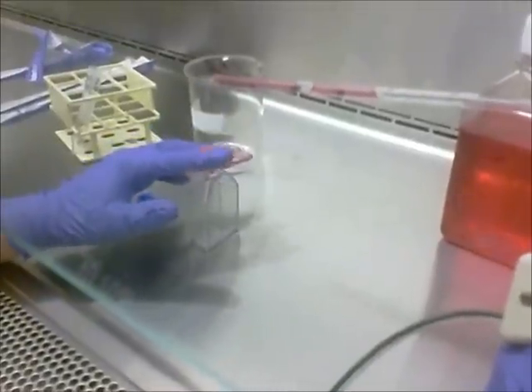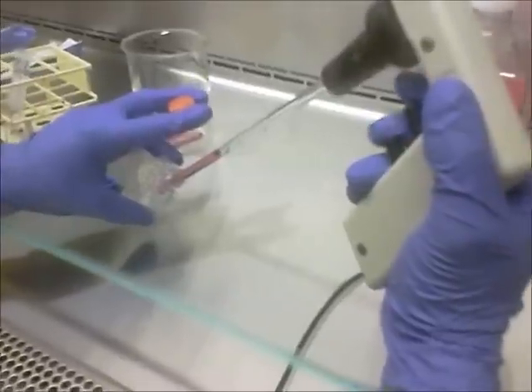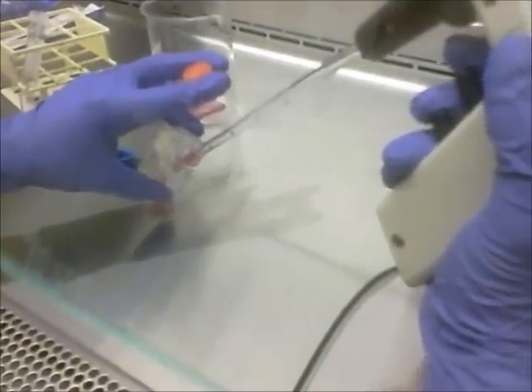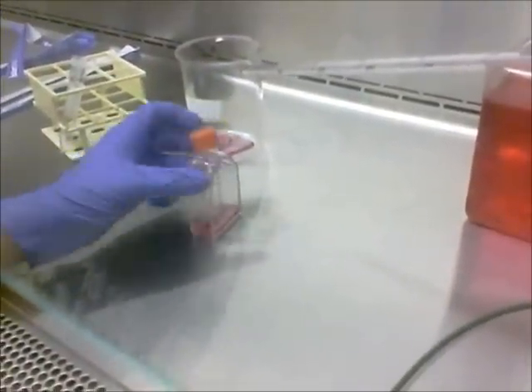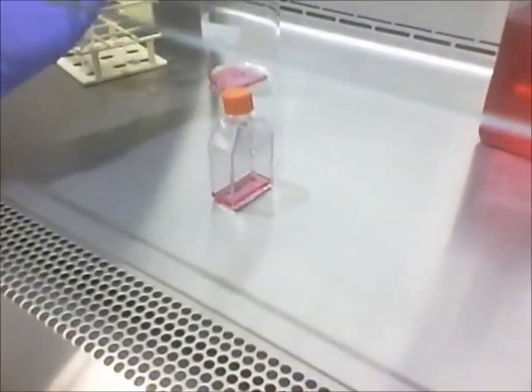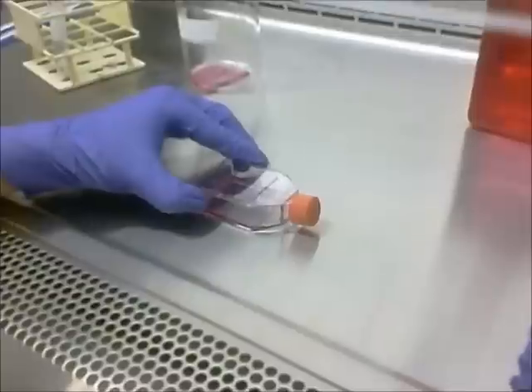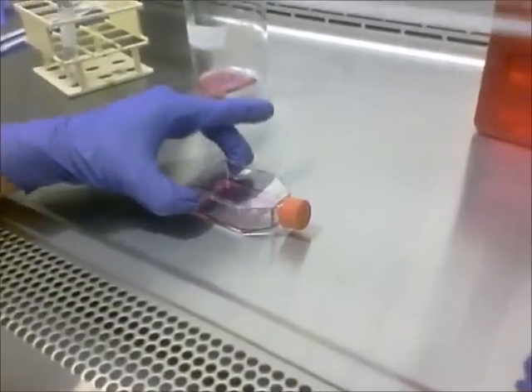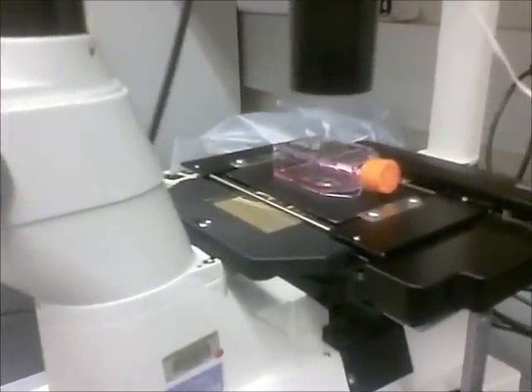Making sure not to touch the rim of the flask and holding the cap between our fingers, we add the media and cells into the flask. Once finished, we take the flask over to the microscope to check that our cells are in the flask properly. Before doing so, we want to make sure the cells have an even distribution, so we move the flask back and forth and side to side. We take a look at our cells under the microscope once more to confirm we have successfully passaged them — and there you have it. We have successfully passaged our cells. Thank you for joining us in the cell culture lab today.